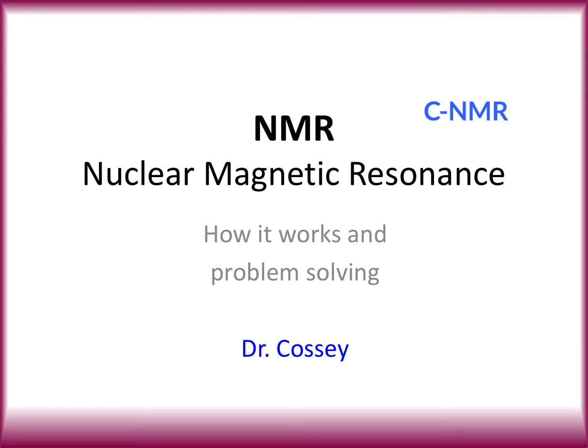What will make this presentation unique is, first of all, the focus on carbon NMR first instead of just hydrogen NMR. And also, we're not going to talk about the theory. So if you wanted to know more about magnetism and spin states, that's not the focus today. The focus today is going to be using it to solve organic type problems.